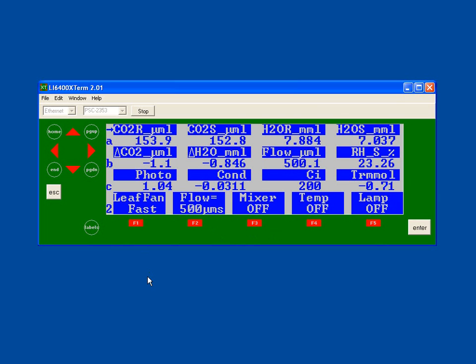A little bit about the screen structure of New Measurements. You'll notice that you have 3 lettered lines that appear on the screen. And next to one of those lines, you will see an arrow, and that arrow is your line selector tool. If you press your up and down arrows, you'll see that the location of that line changes. Depending on which line you're selecting, you can change what you're displaying on that line by selecting a different letter.